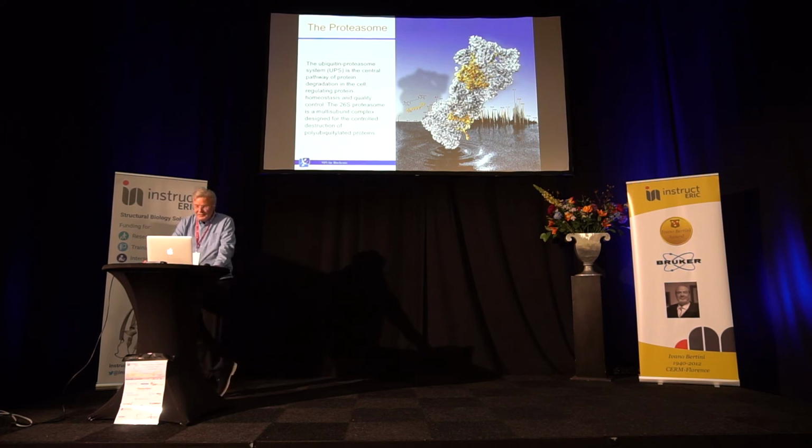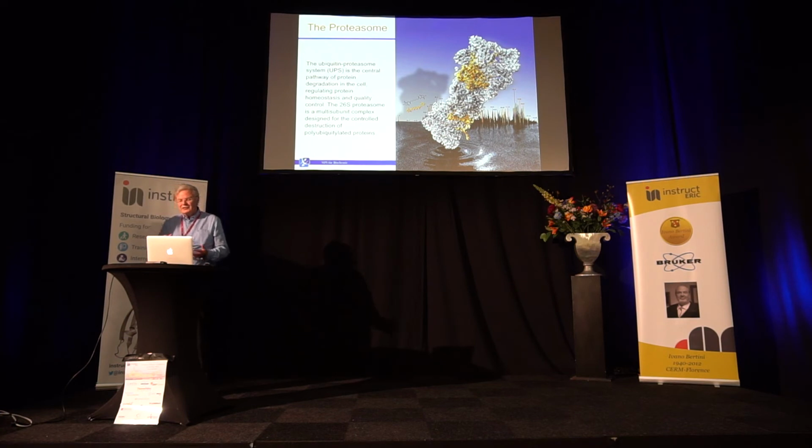Now, this image I show here is more than 10 years old. That was a resolution of something like 8 angstroms at the time. It was definitely not good enough to determine the position and the architecture in terms of subunit structure. So we used at that time, and I will come back to that because I think it will become important, that was also mentioned by Philip Zelenko, I think again, to use orthogonal data.